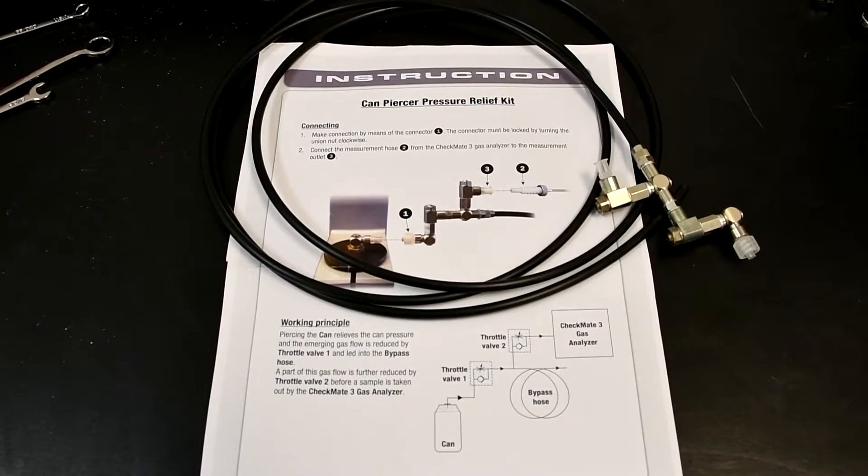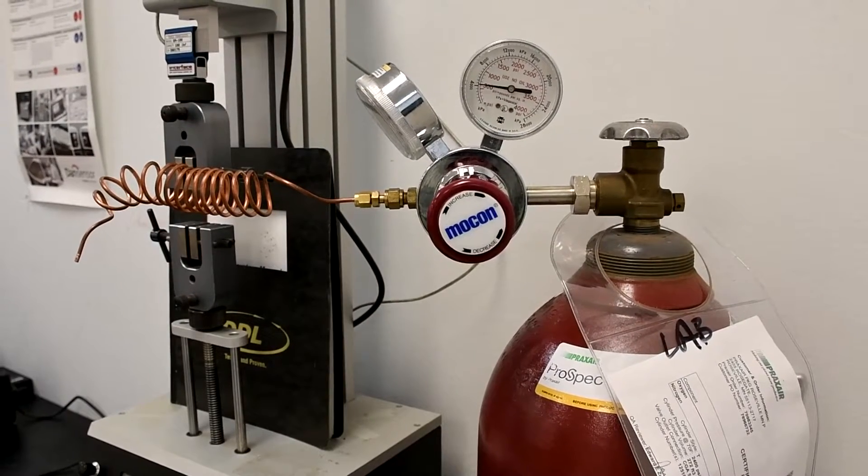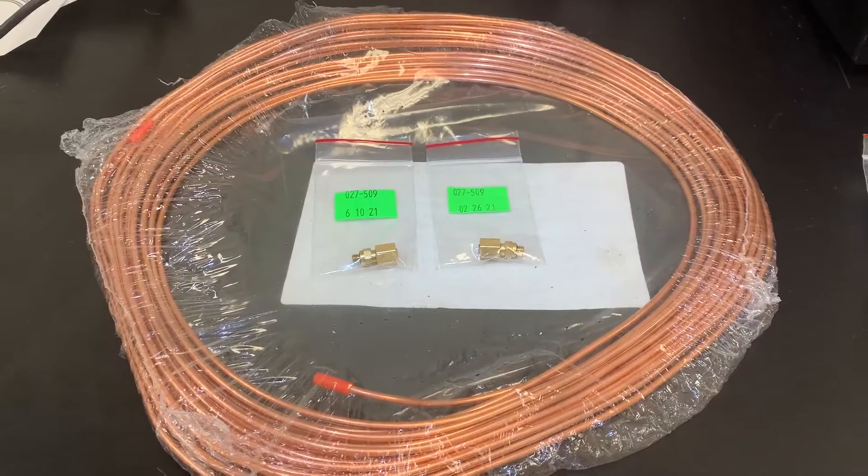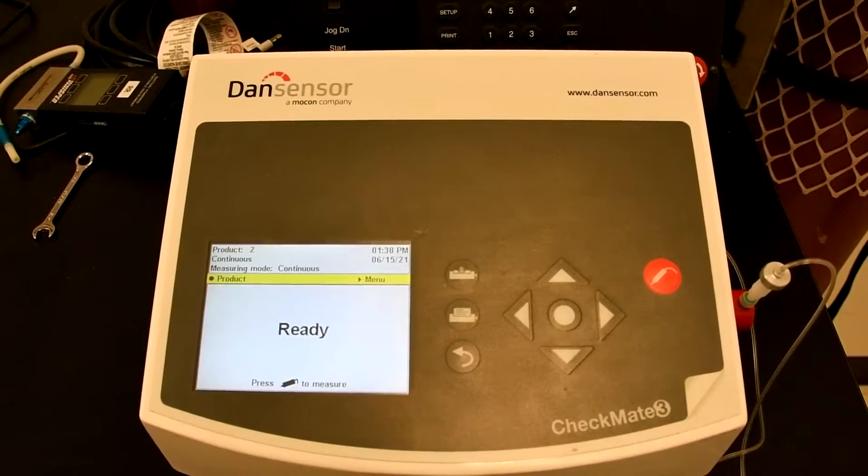Here's what you'll need. The pressure relief kit included in your field verification kit. Gas tank. We recommend a T size. Connections. Connector fittings and copper tubing included in the field verification kit. Checkmate 3.